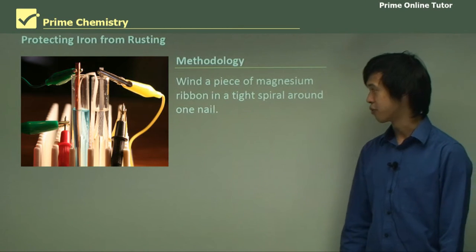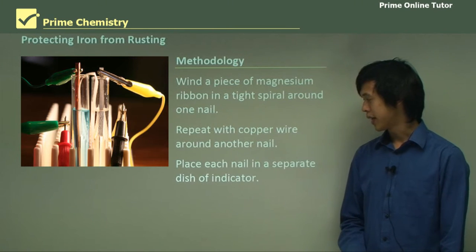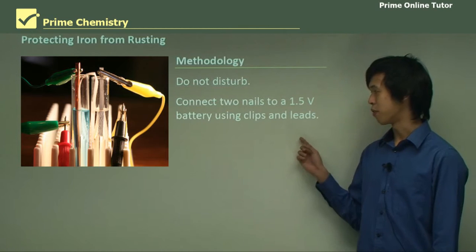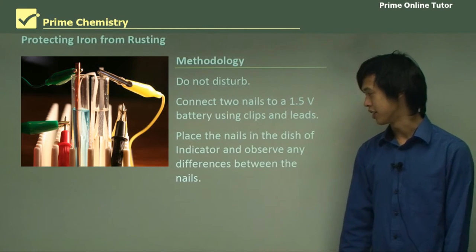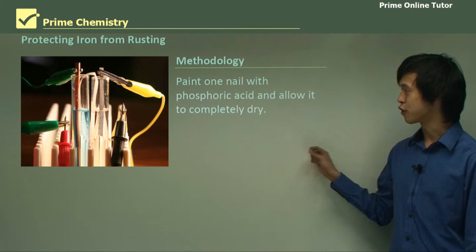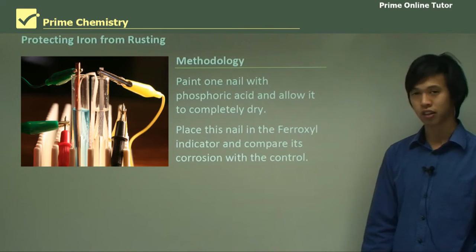Wind a piece of magnesium ribbon in a tight spiral around one nail. Repeat with the copper wire and another nail. Place each nail in a separate dish of indicator and don't disturb. Connect two nails to a 1.5 volt battery using the clips and leads, and place the nails in the dish of indicator and observe any differences between the nails. We can also paint one nail with phosphoric acid, allow it to completely dry, then place this nail in the ferroxyl indicator and compare its corrosion with the control.